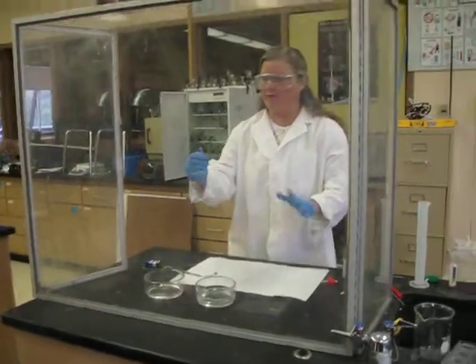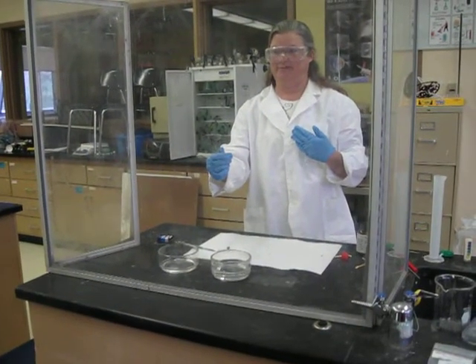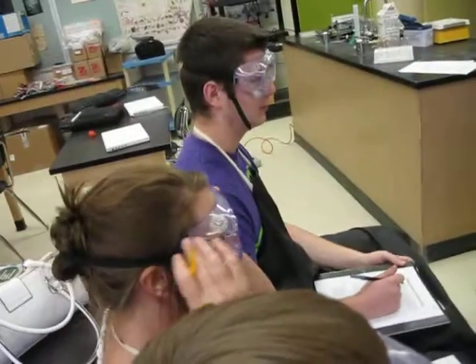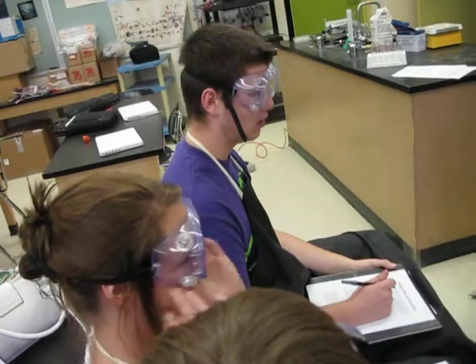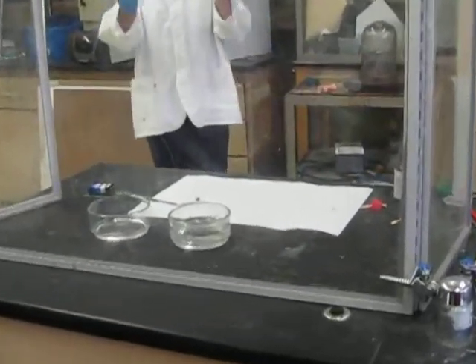Alrighty, now here's our first chemical reaction. We're going to put our goggles on. Okay, this one doesn't explode. You're safe. I promise. Oh man, buzzkill. Okay, and we're just going to watch what happens to our lithium as we put it into the water.